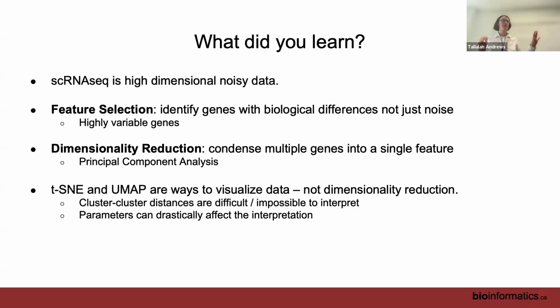The original version of t-SNE's first guess was to just randomly throw the dots onto 2 dimensions. Whereas the first version of UMAP did PCA first and used the first 2 principal components as the initial guess. Using the first 2 principal components made it a lot more stable because every time it was starting at the same place.